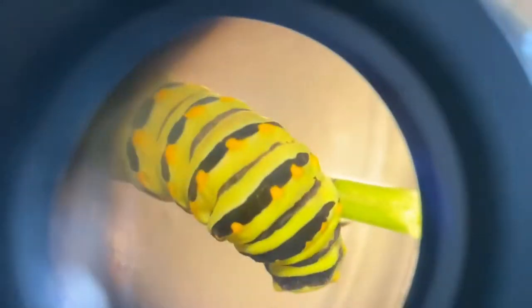It's really hard to keep the camera lined up just perfect. It's pretty cute! He just tipped over — that is so cute.